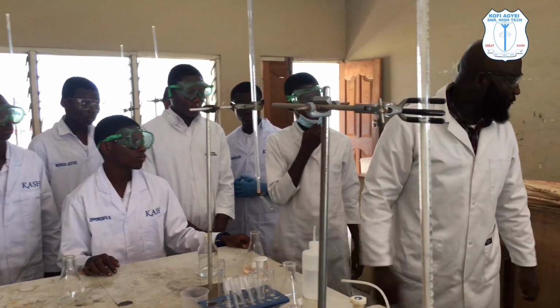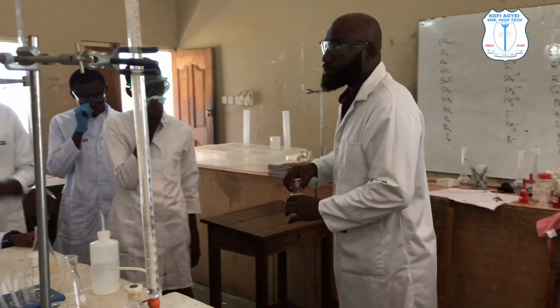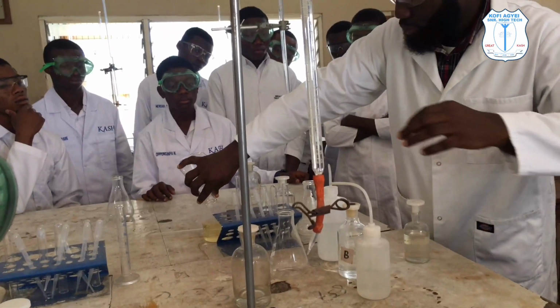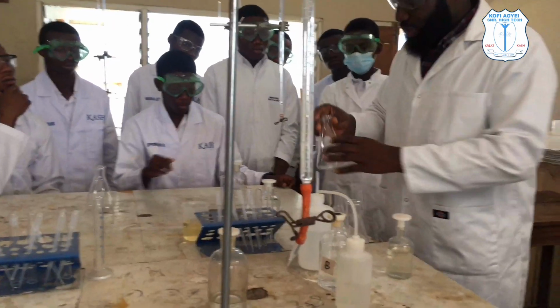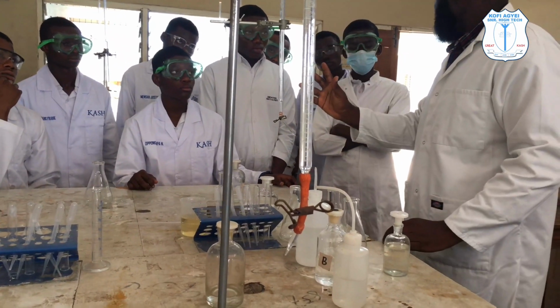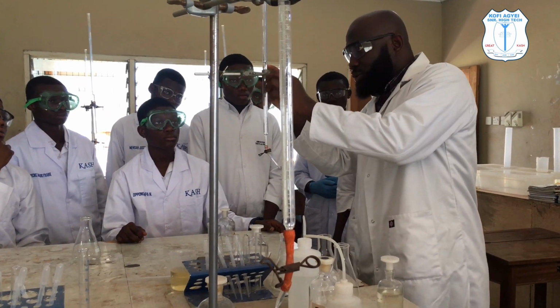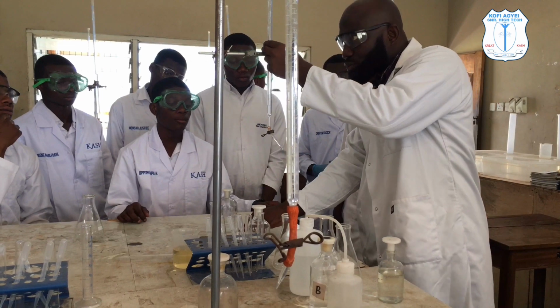Yeah, now with phenolphthalein. Now, the phenolphthalein also comes with a different nature. So, with the experiment, you are going to do it 3 times. Do you get it? Then you record your values nicely. Understood? You take your reading nicely. Do you get it? So, as I said, you take the reading from the bottom of the meniscus.